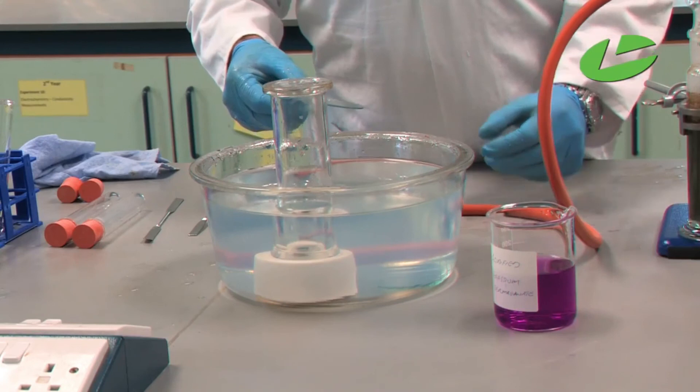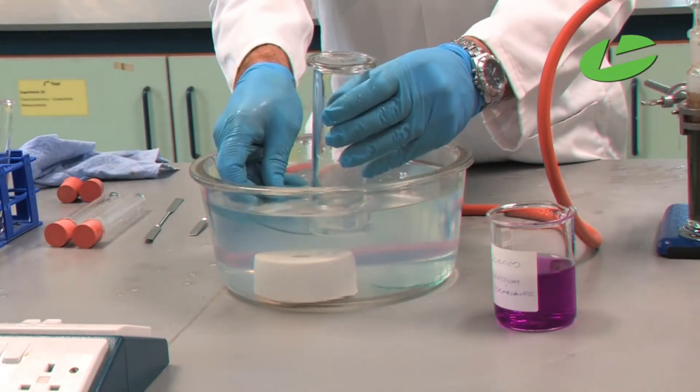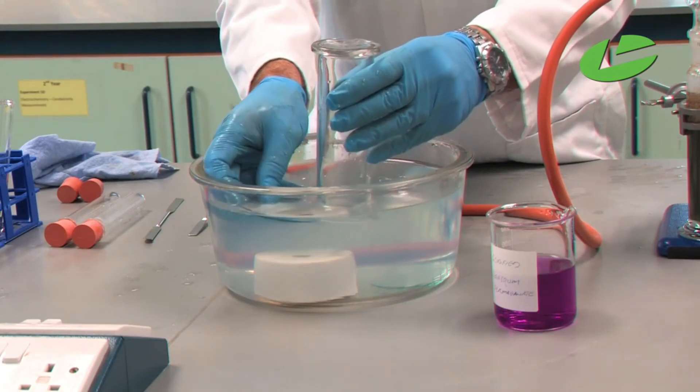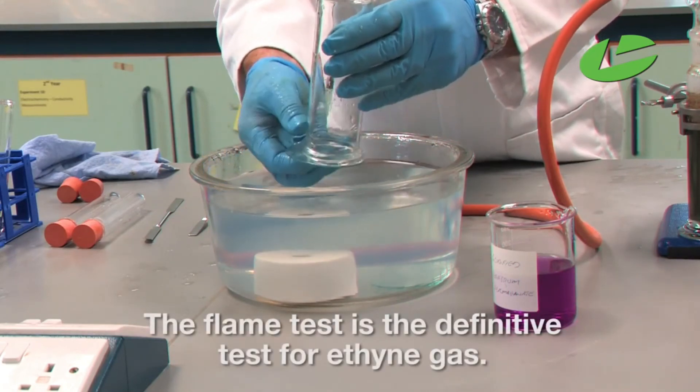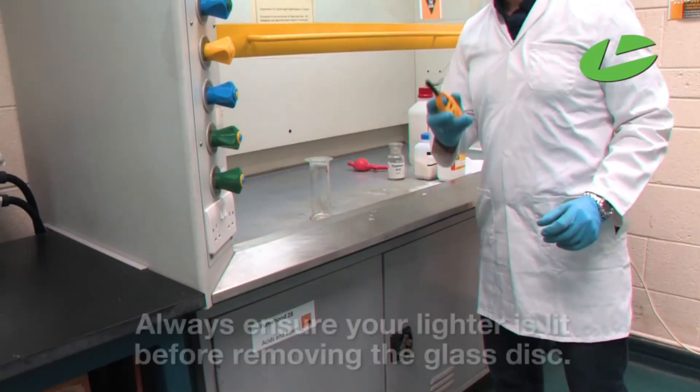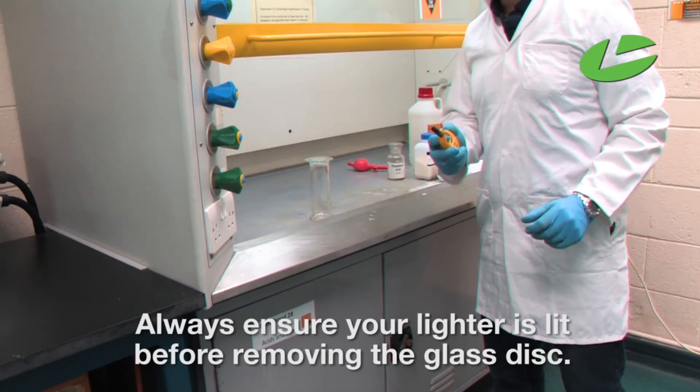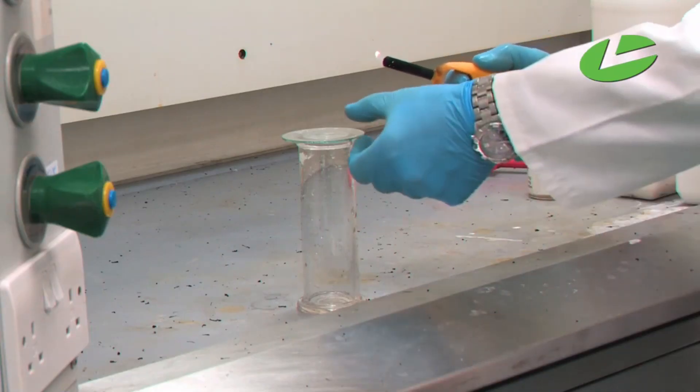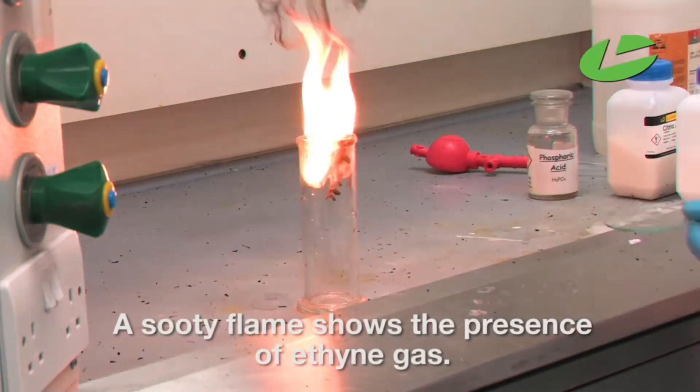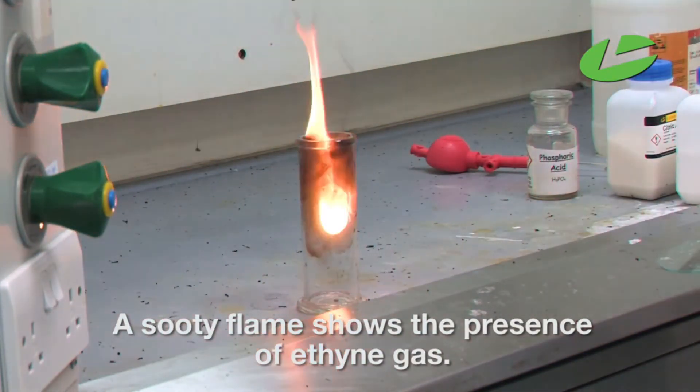Now take out the gas jar by slipping the glass disc underneath before lifting it from the water. Put the jar in the fume cupboard. Always make sure your lighter is lit before you remove the glass disc. You can see the sooty flame - we've definitely produced ethyne gas.